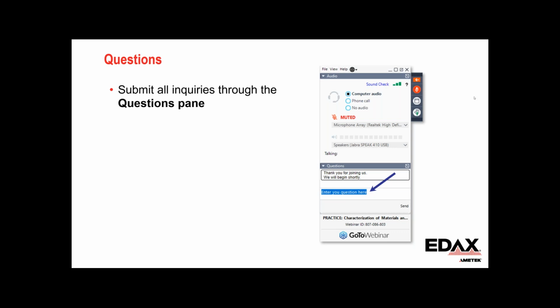So, our speeds now, we're getting patterns 120 by 120 pixels-ish at the highest speeds. That resolution ties in well with our default Hough. We can go to less binning to get 240 by 240-ish pixel patterns, and we get that at a rate of more like 1,000 to 1,200 patterns per second.